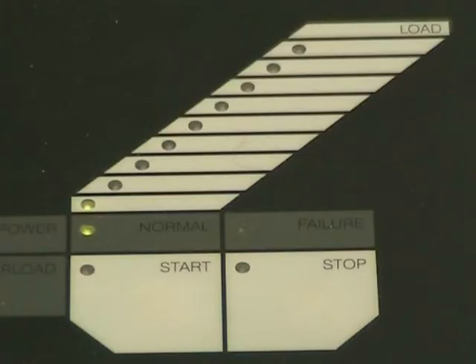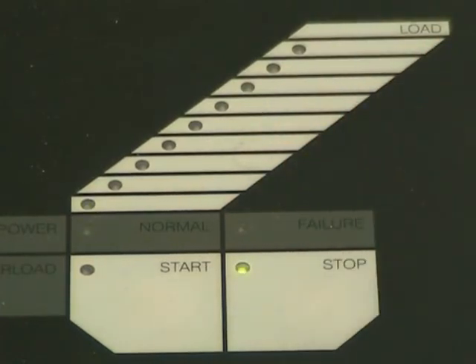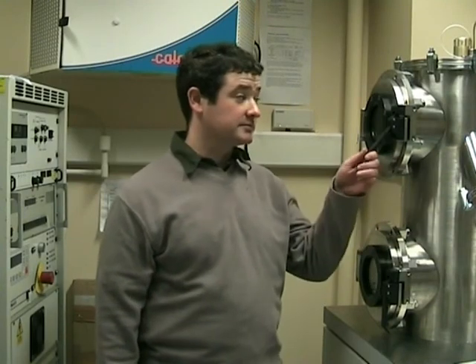Press the stop button. It will take a few minutes for the chamber to reach atmosphere. If the evaporator is still in the vacuum, you will not be able to open the doors. Do not try to force it.